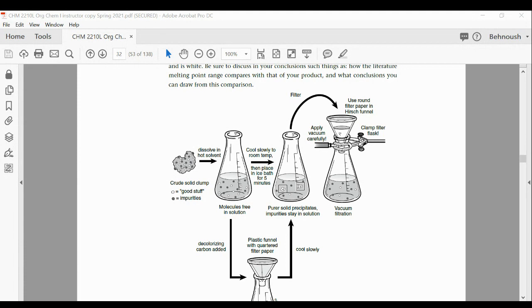The only thing I don't have is the mass of the watch glass, because I assumed that I would figure that out mathematically with the watch glass. Oh, okay. So is that fine?